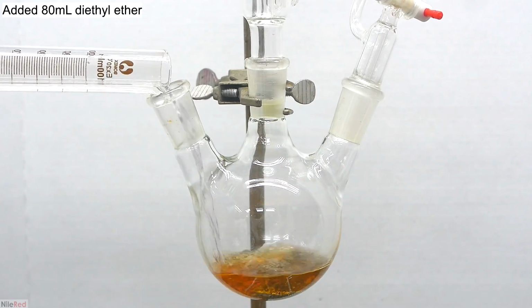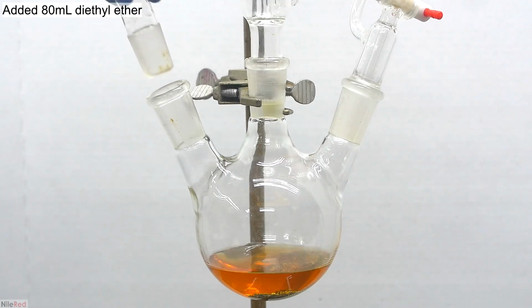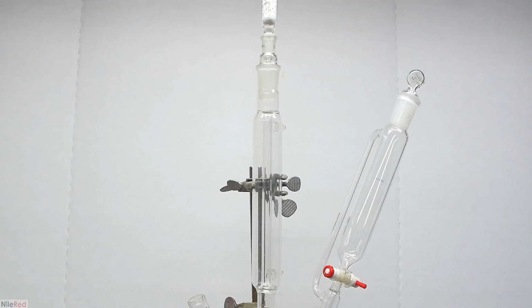When the ether is added, you can see it take on a slight orange color, and this is because some of the iodine is dissolving into the ether. On top of the condenser is placed the drying tube that's packed with anhydrous calcium chloride. This reaction is pretty sensitive to water, and the drying tube limits the amount of moisture that gets into the system.